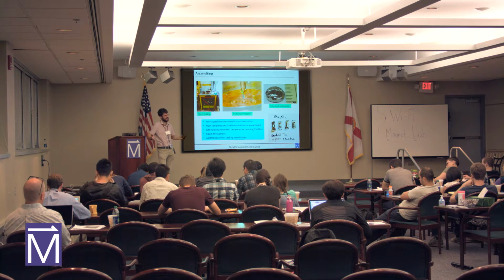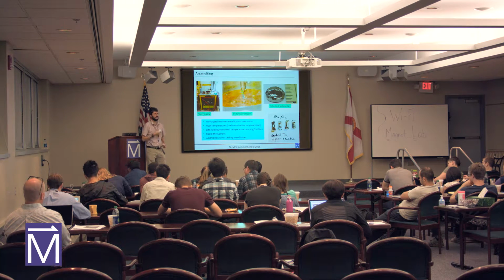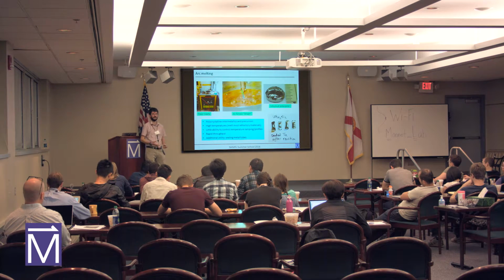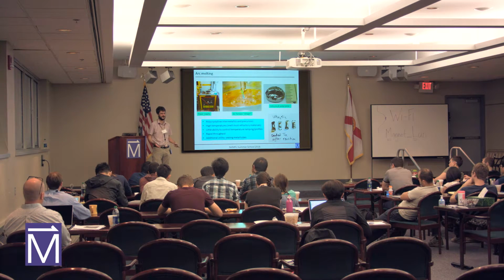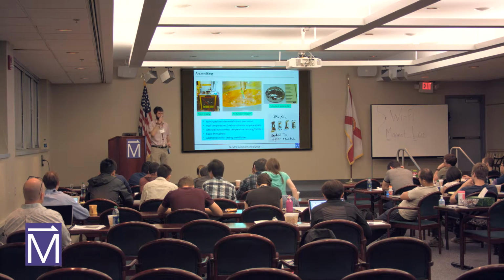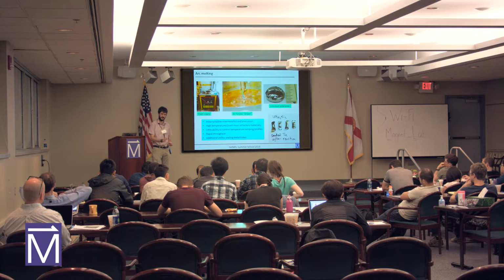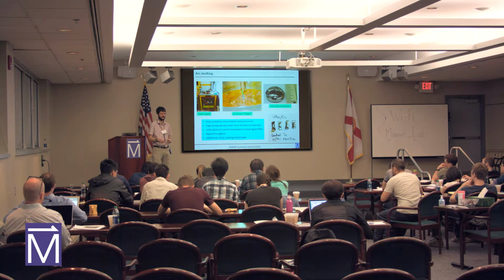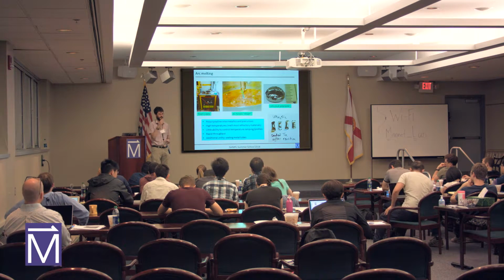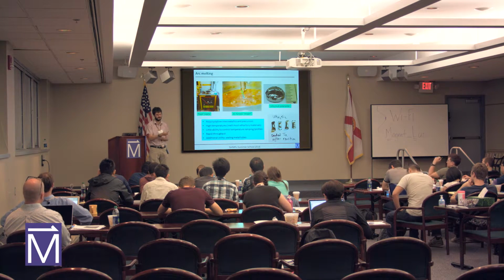Yeah. So it's on a case-by-case basis. If I am arc melting something, usually they don't explode. If it's going to explode, it doesn't explode on the first melt, right? But it may explode on the second or third melt. If I flip it and it explodes, then I say to myself, I'm never flipping this one again, right? I just start over and do it one time and then maybe anneal it, to try and make it higher quality. But a lot of these materials, even after one flip, if it's a line compound that will form directly out of a melt, you can have a homogeneous mixture after one melt. Maybe you should sit on it with the arc for twice as long as you normally would, or something like that.